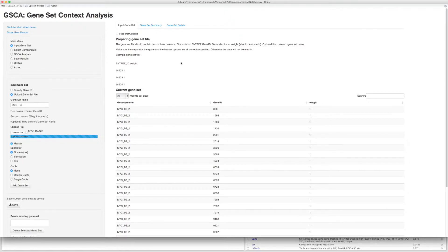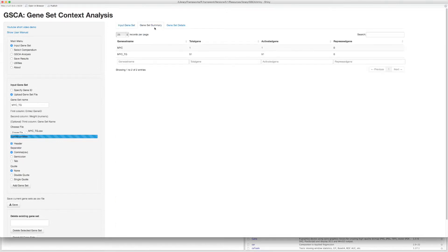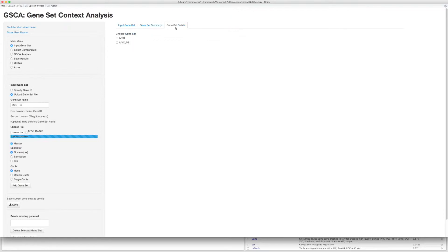The Gene Set Summary tab shows a brief description of the gene sets you have already given. You can also check the details of the given gene sets by going to the Gene Set Details tab.